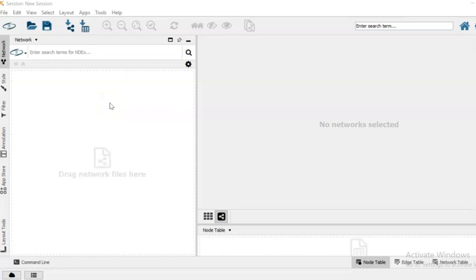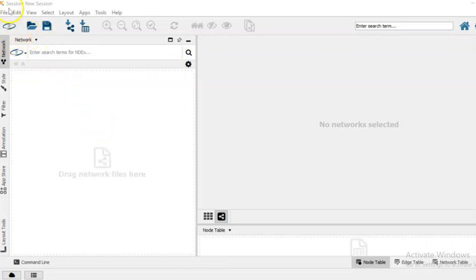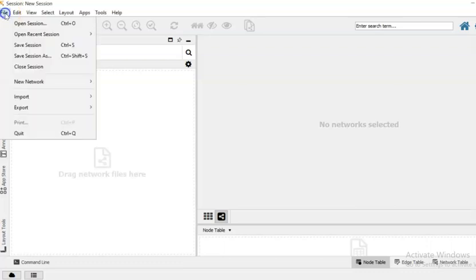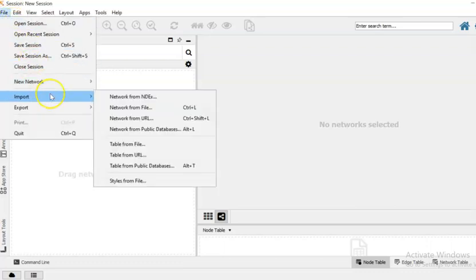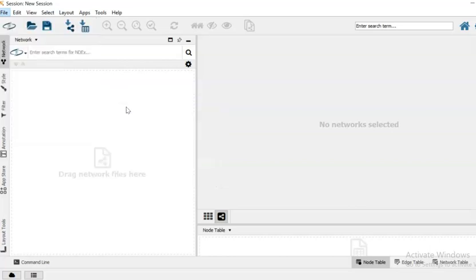Now we can visualize the graph that we saved in Cytoscape. To do that you have to open your Cytoscape and then go to file, then import network from file.